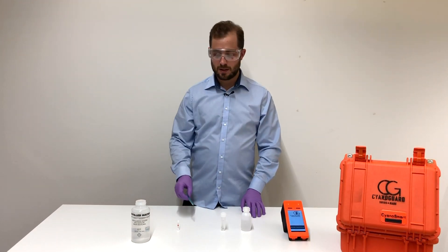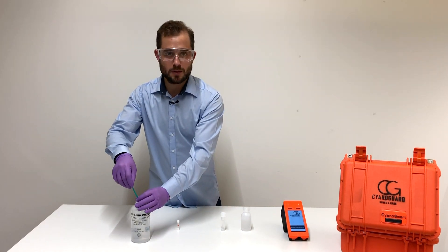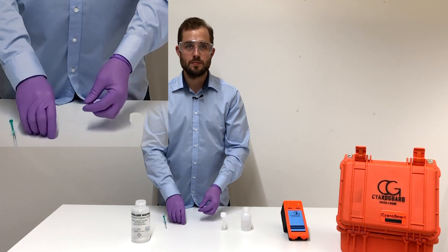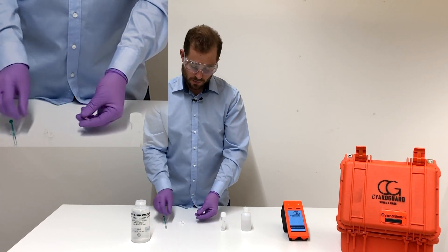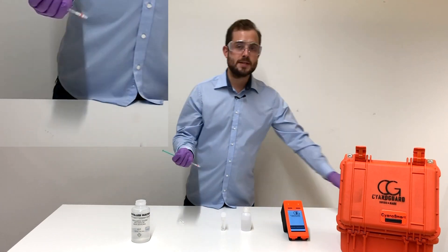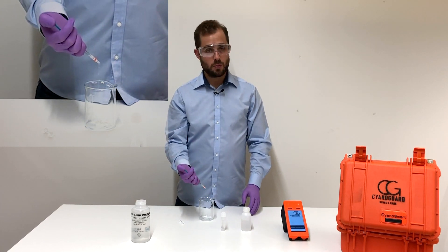Let's start with rinsing the cartridge. Take up one milliliter of water, open the cartridge, connect the syringe to the cartridge, and simply rinse the cartridge with water.